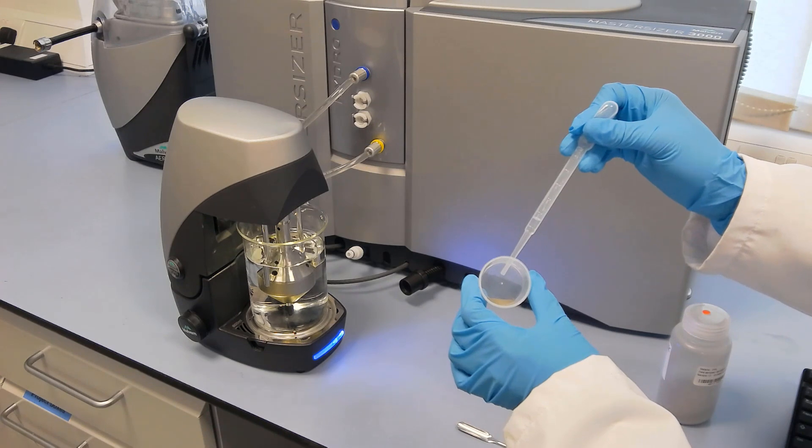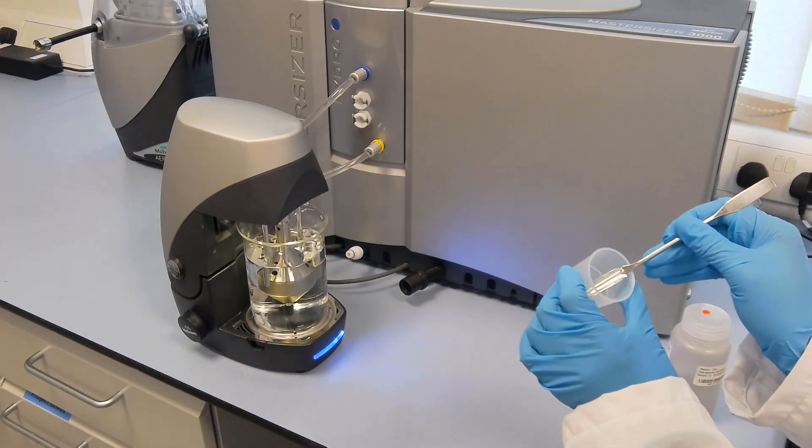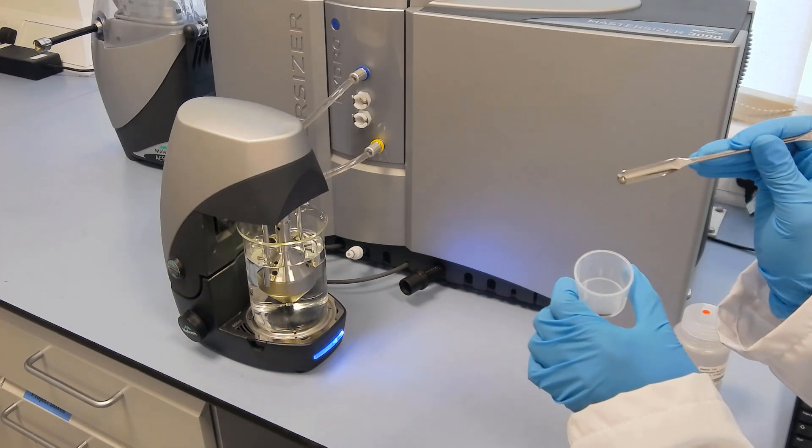For greater control, the metal powder can first be wet with a few drops of the dispersant, in this case water, which creates a paste-like preparation.